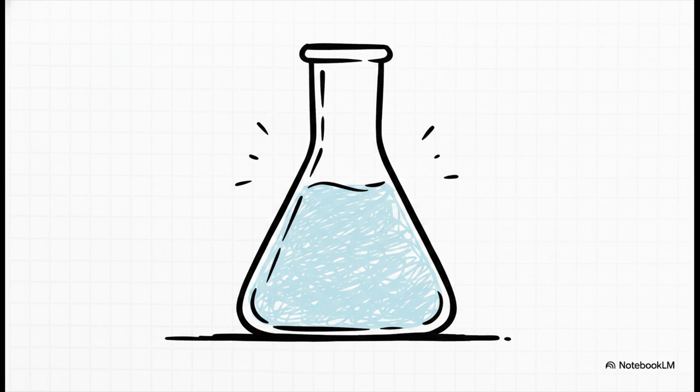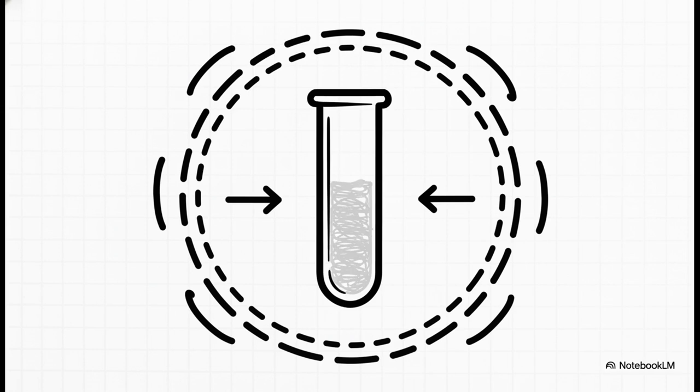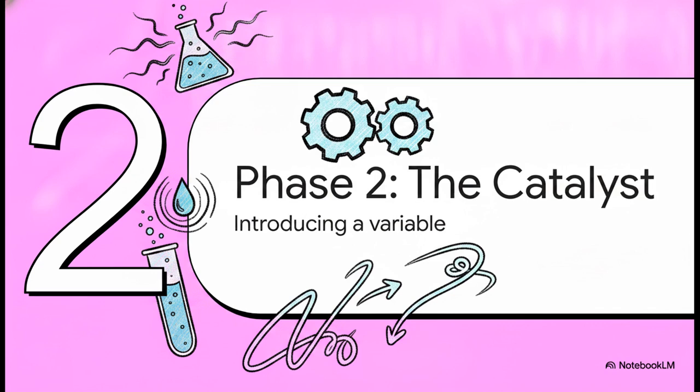No lengthy, boring history of how it was discovered. It just simply isolates the specific ingredient, lead nitrate, in solution form as the critical starting point. It's the foundation of the whole shebang. And check out how highly specific the text gets about the environment. In a test tube. This provides our physical baseline. We're isolating that lead nitrate so that whatever happens next is going to occur in a perfectly controlled, totally observable arena.